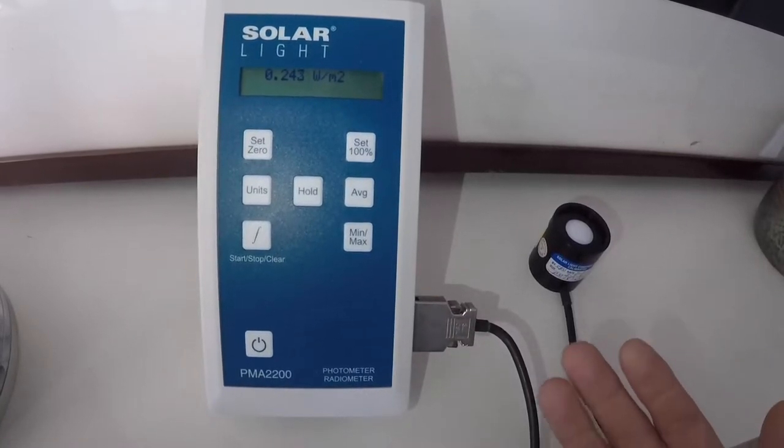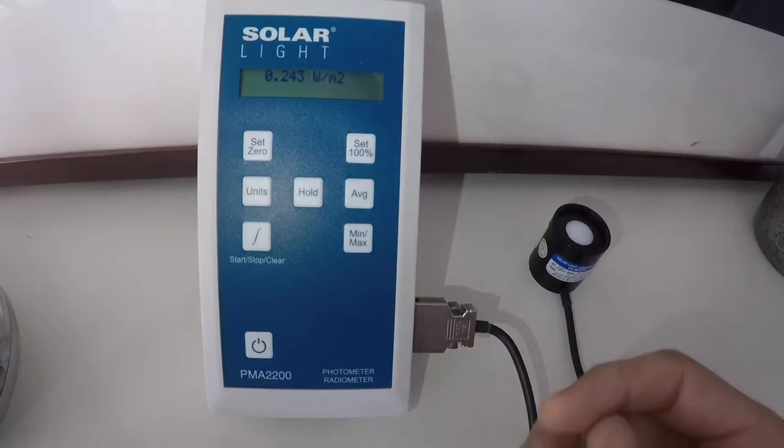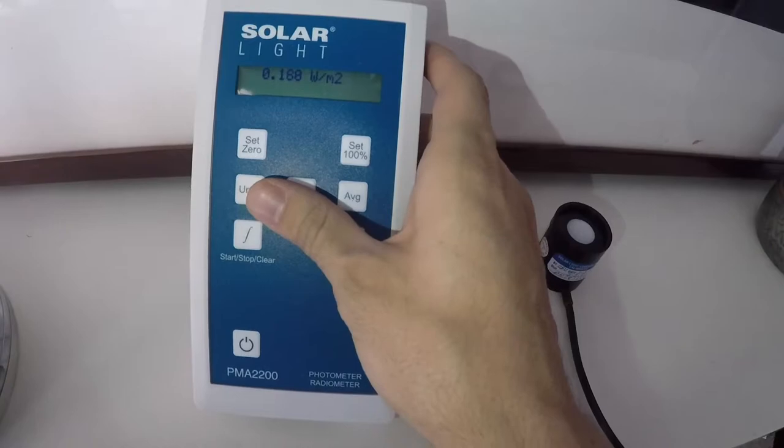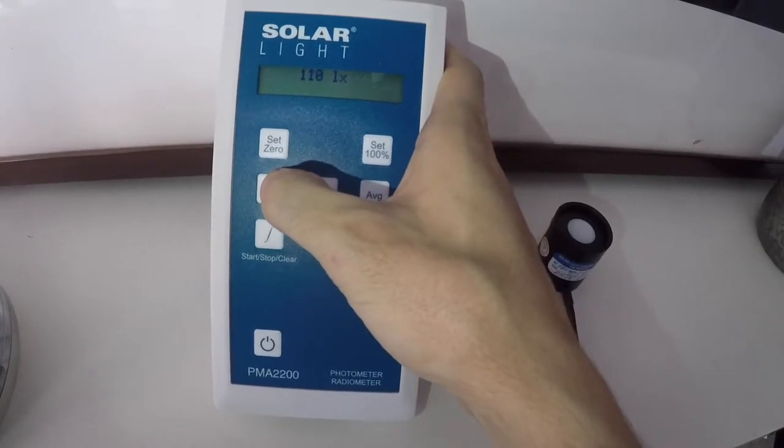I have my sensor plugged in, and we have it up and running. If we look up top we can see that we're getting data. If I use my Units button, I can switch between all the different available units that the sensor comes with.